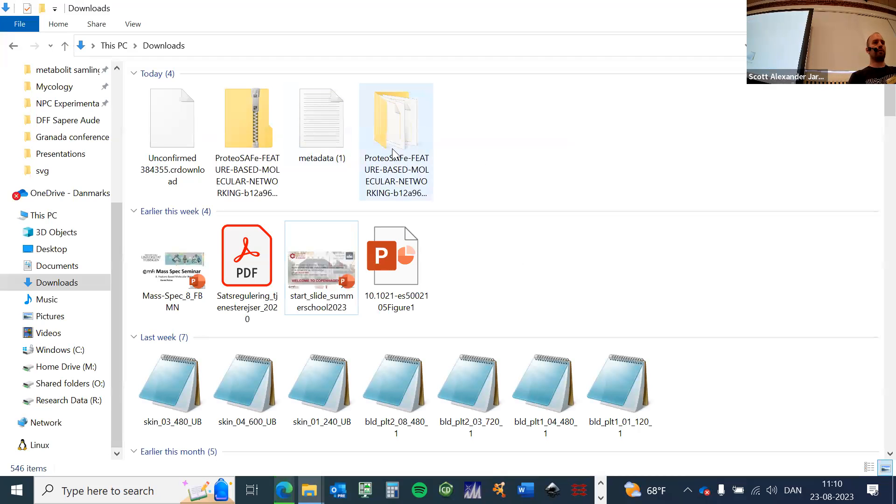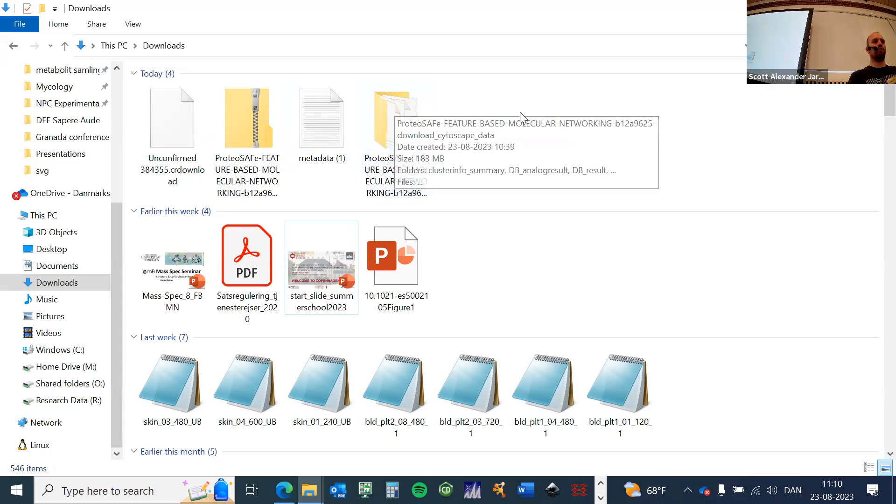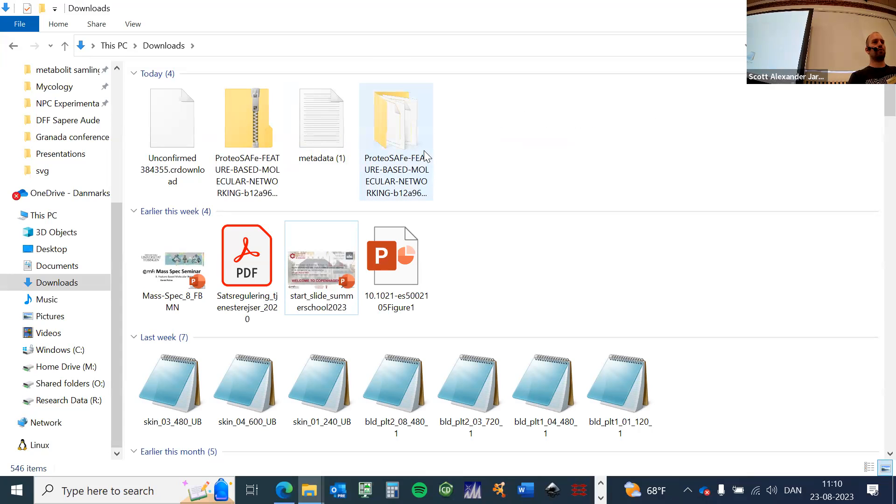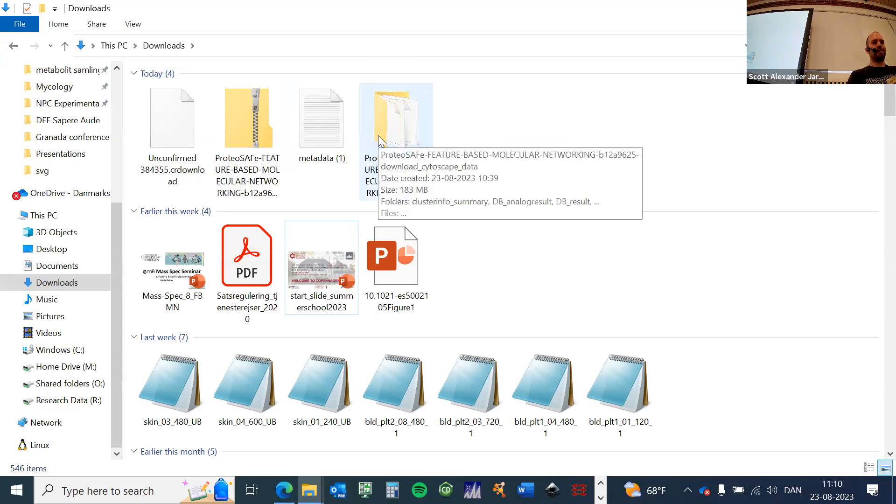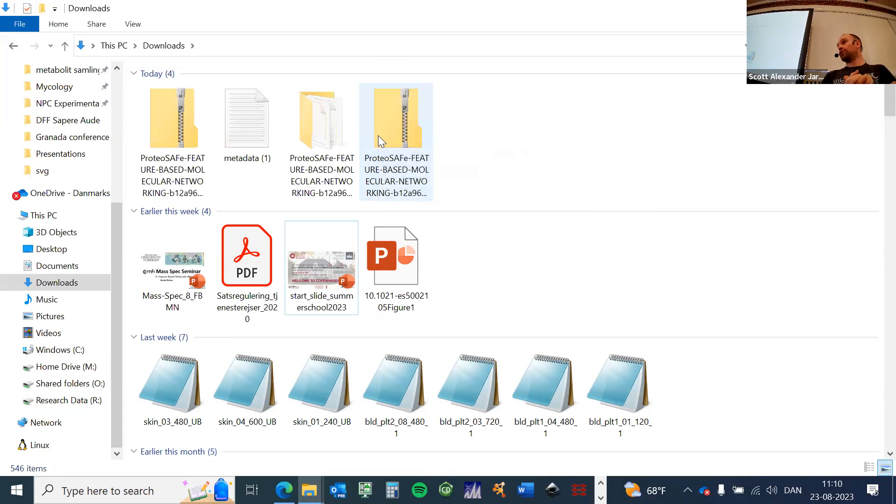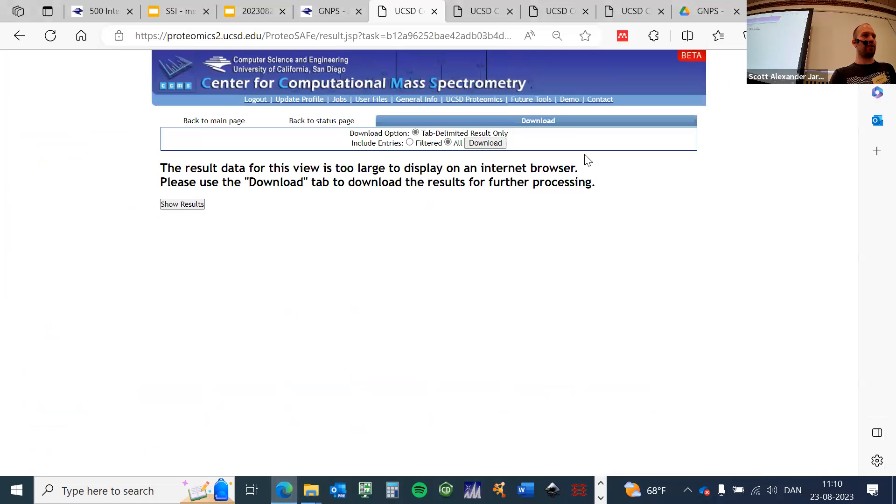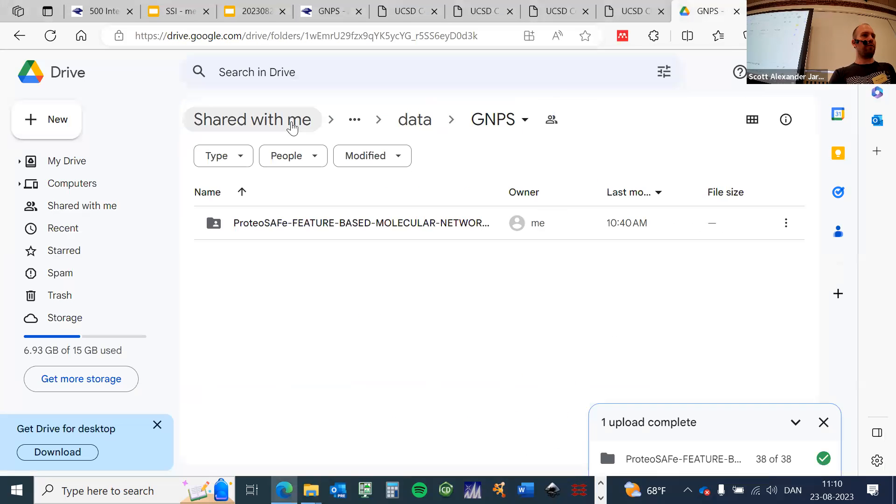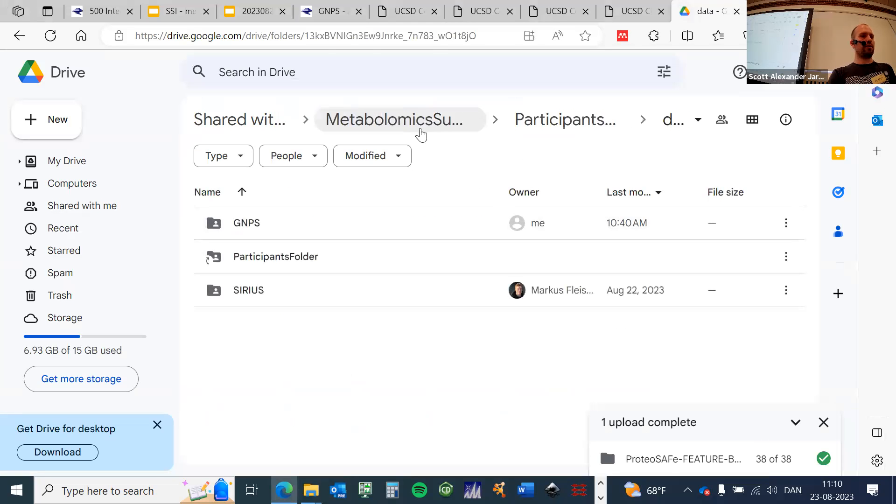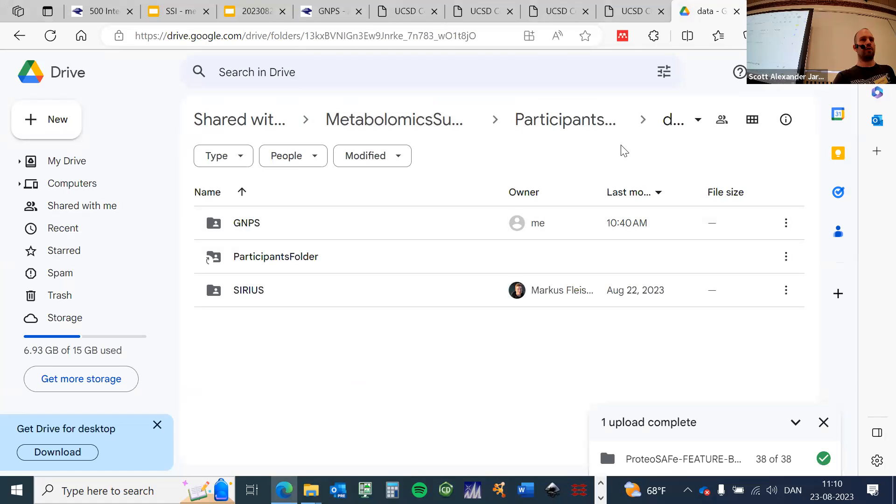Then I will get such a folder for the job with a long string. Now, because we killed the server, I actually downloaded it for you from our beta server and uploaded it on the shared Google Drive. So if you go to the Google Drive, you should be able to see now a GNPS folder under the data folder.